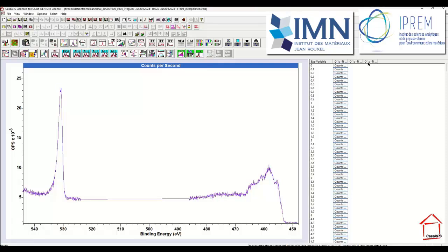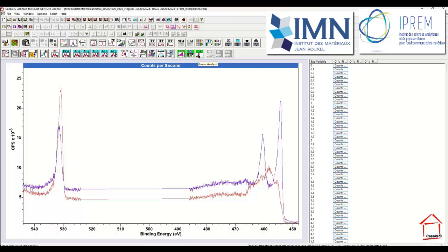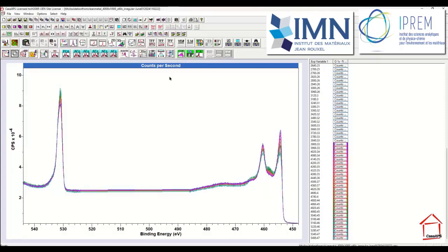Therefore I have two component spectra that I have identified from the subset of spectra in the file. The final step is to now test these component spectra against the data that I previously used to construct these spectra. So let's take these. They're already selected, I believe. Yes, they're already selected. I'm going to go back to the data file.